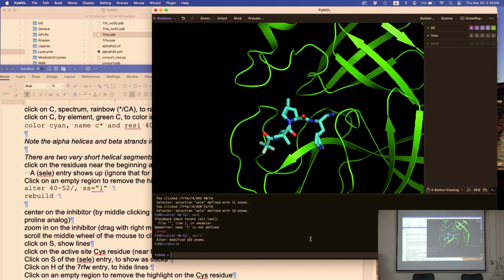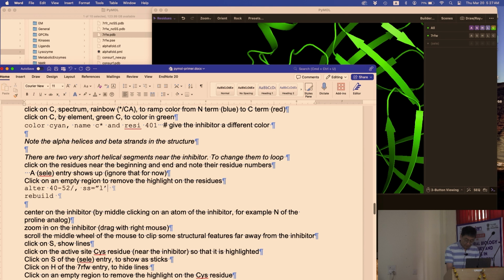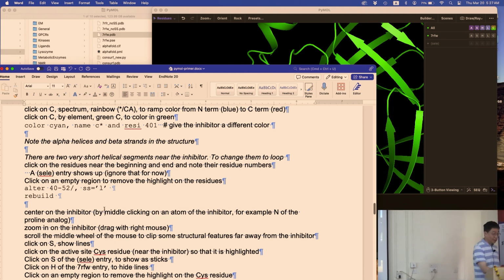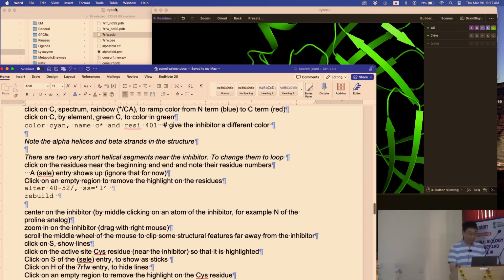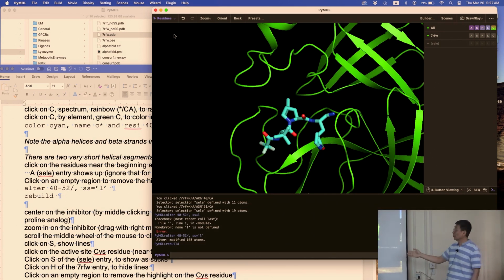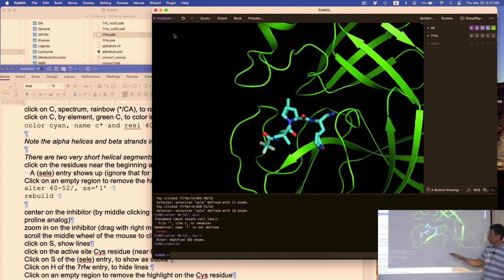Let me change the primer right now. So then, I'm sorry. Like that. If you do it this way, then it should work. Okay, let me save it. See, it's good to come all the way to India to teach. Now I know I have a mistake in my primer. Beautiful, thank you. Okay, so now you're all here? Okay, so if you couldn't get this to work, this is a minor thing, so don't worry too much about it.